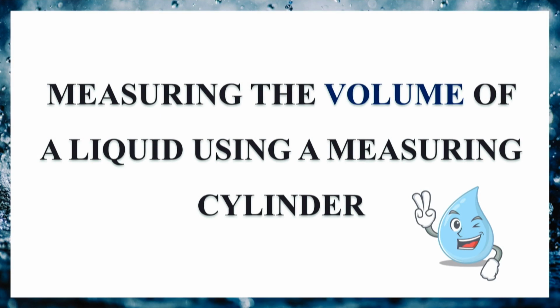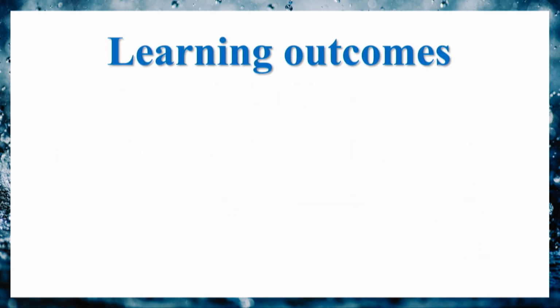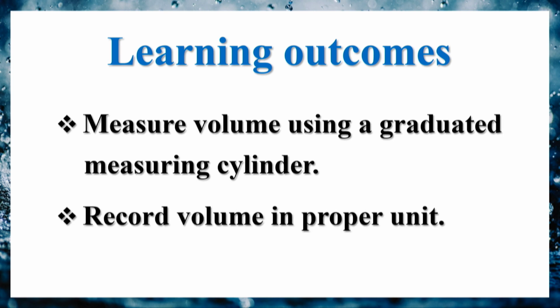Hello friends, welcome to this lesson on measurement of volume of a liquid using a measuring cylinder. By the end of it, you should be able to describe how to use a measuring cylinder to measure and record volume of liquids.